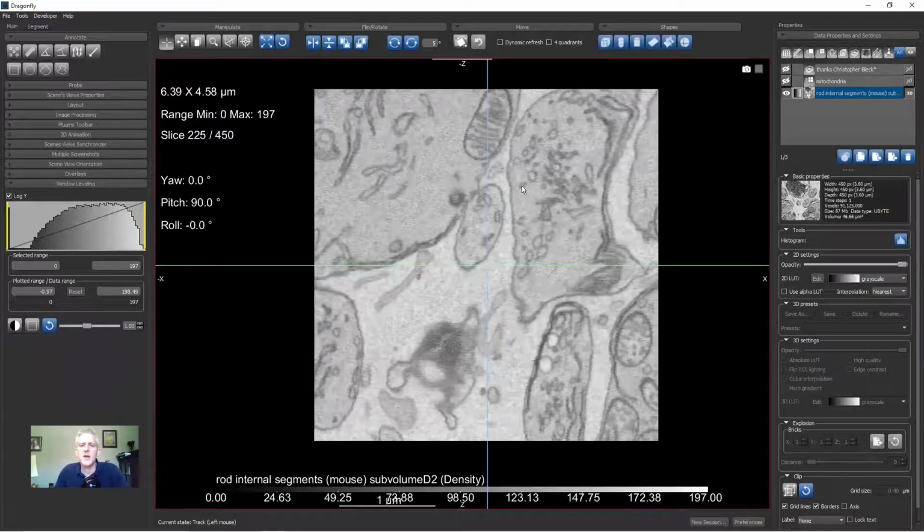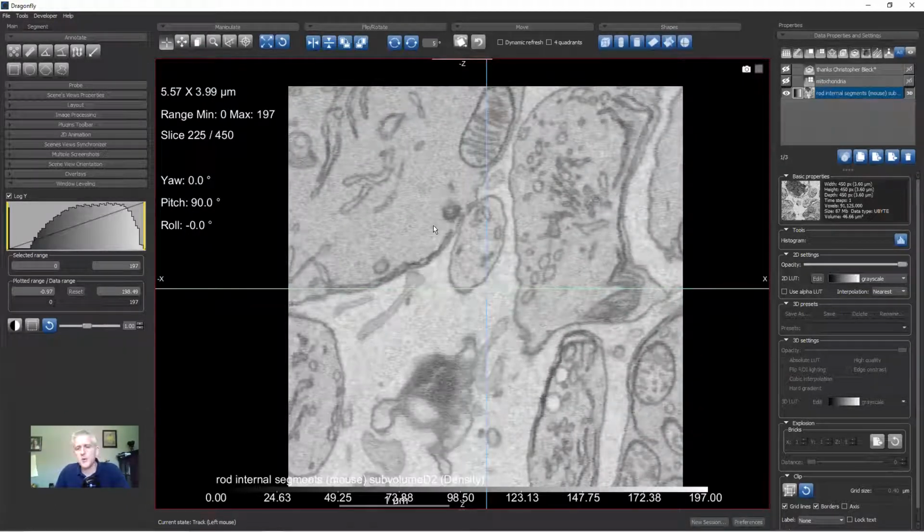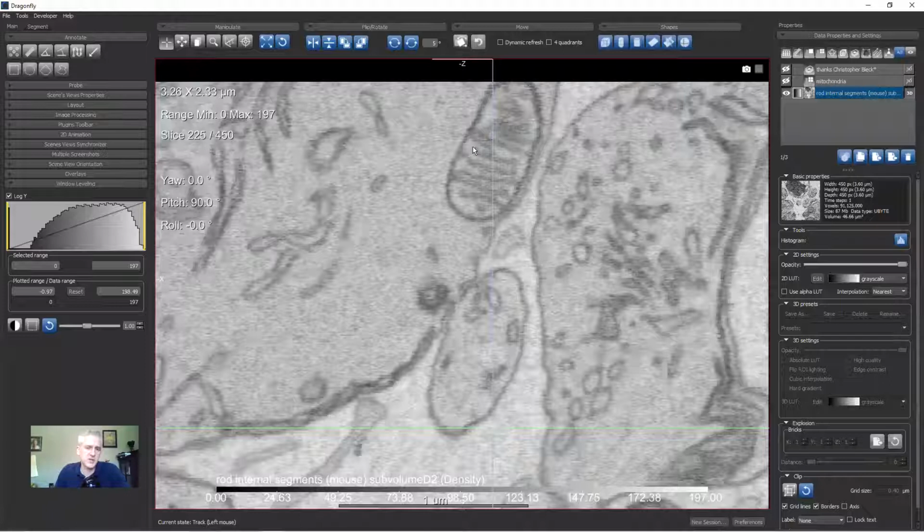All right, now the very first thing I'm going to do is invert these data. In imaging conventions, most imaging techniques show the presence of signal as high intensity, and high intensity is usually rendered as white. Biologists have, for decades now, often used an alternative convention where high signal, wherever the stain went to in your biological sample, has low intensity and is dark.